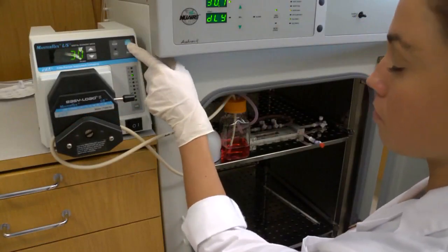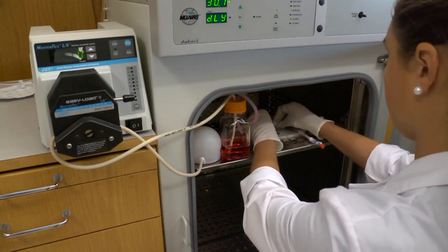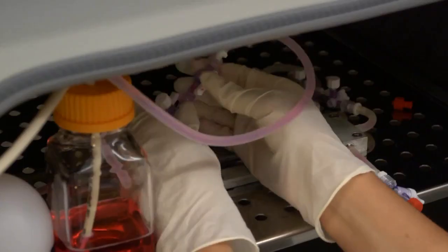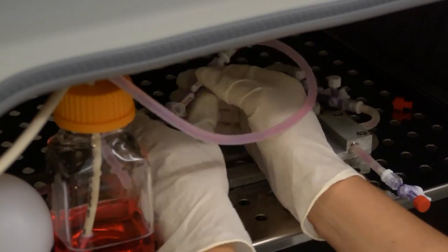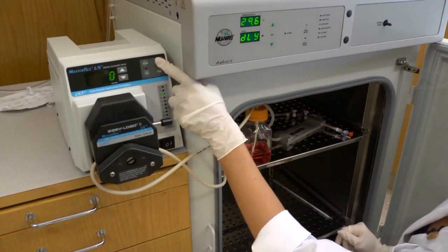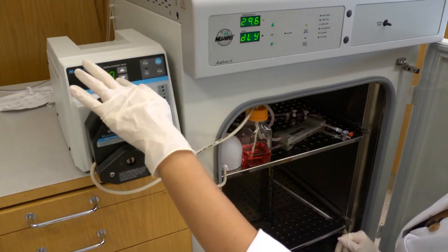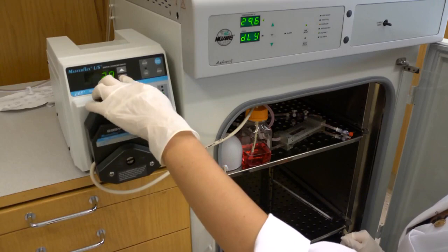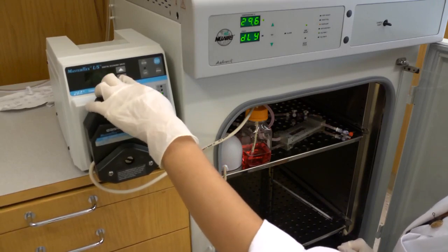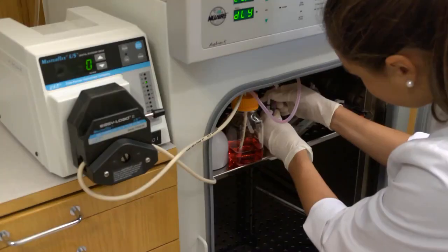Pause the flow circuit pump. Close off the flow circuit stopcocks in the direction of flow to prevent leakage. Connect the flow chamber to the flow circuit. After the flow chamber has been connected to the flow circuit, open the stopcocks in the direction of flow. Resume the flow pump and ensure that the perfusate flows in the correct direction. Adjust the flow rate to the desired shear stress.